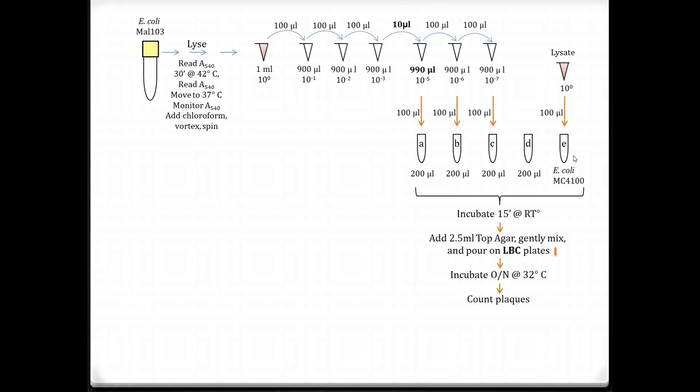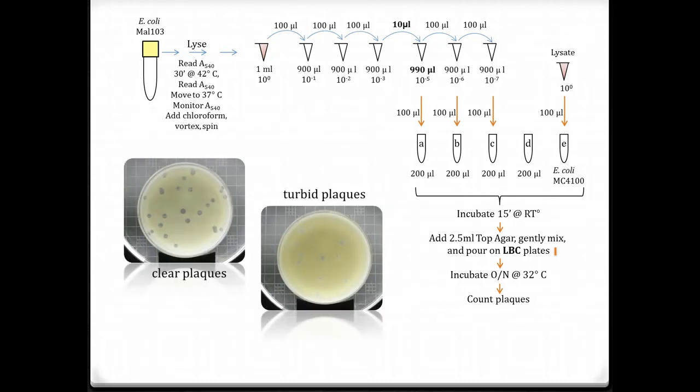We put only phage, no cells in there. Should we see a lawn? Should we see any colonies at all? If you see any colonies, what happened? So these are not mu plaques. Mu plaques would be kind of hard to see on here. These are a little bigger than the plaques you're going to see.